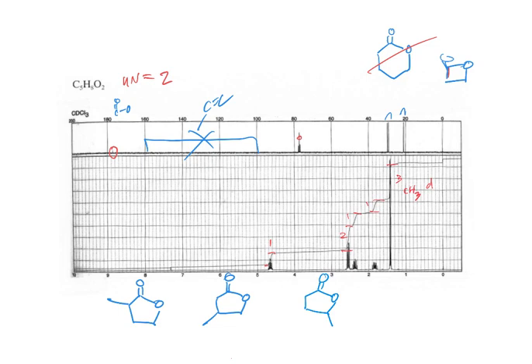Yeah. Well, it's at like 1.4, so obviously it's not connected to an oxygen, but it's close. Maybe. And my guess would be that the oxygen that's in the ring is more electron withdrawing than the carbonyl part of the ester. So I'm gonna guess the last one.